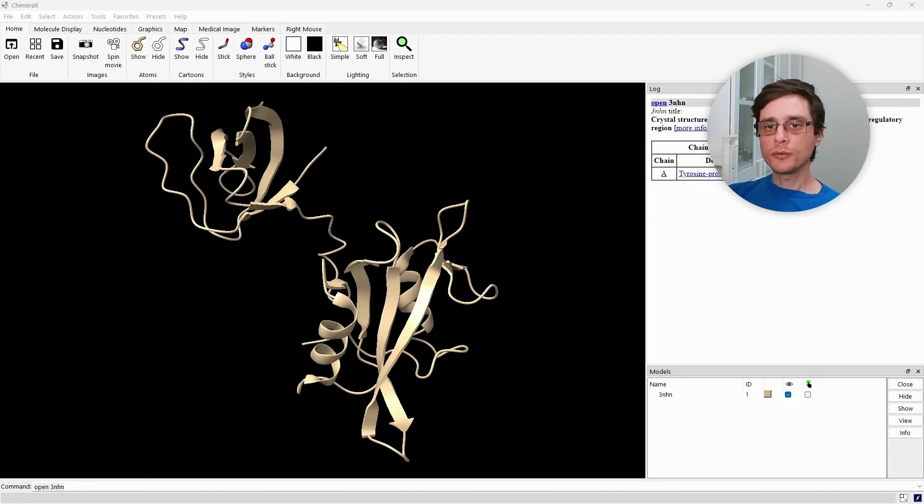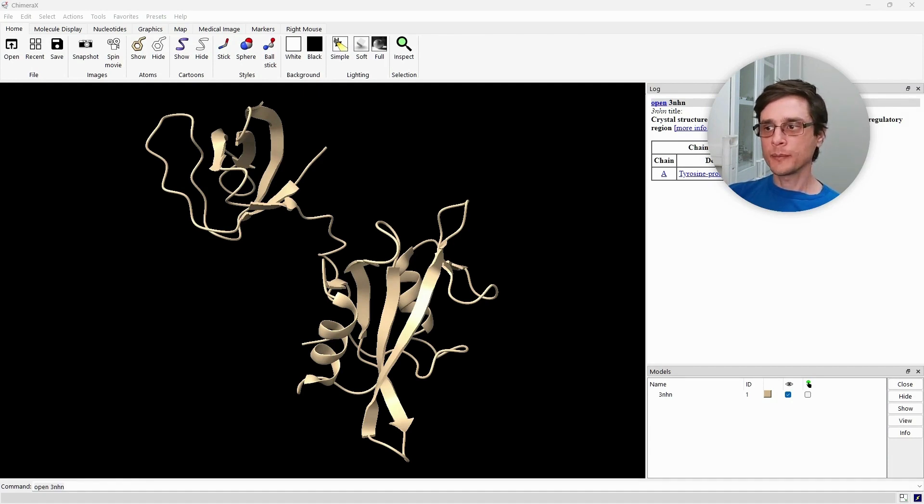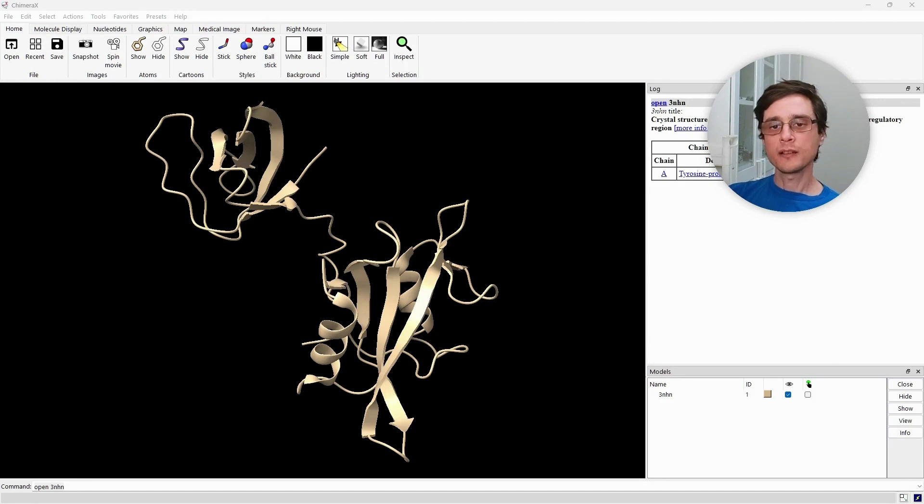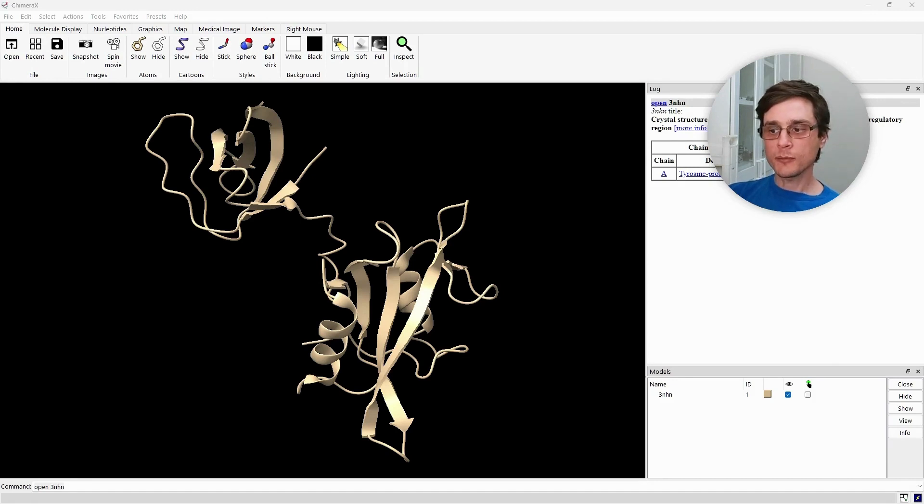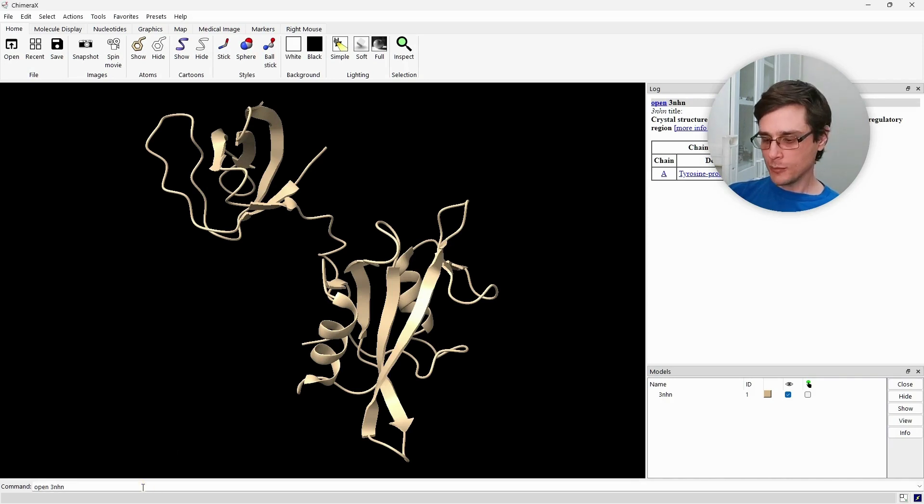ChimeraX usually has good defaults for newly loaded structures. Since we want to demonstrate different stylings, we are going to load the same structure five more times by pressing enter five more times for the same open command.